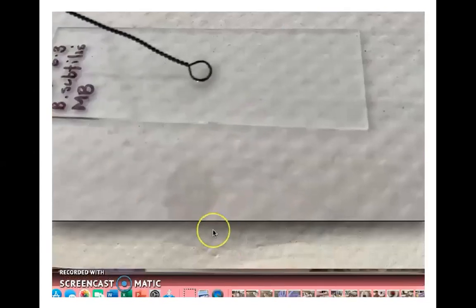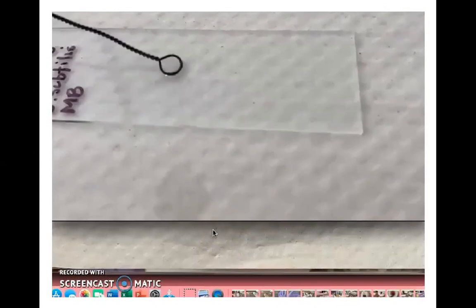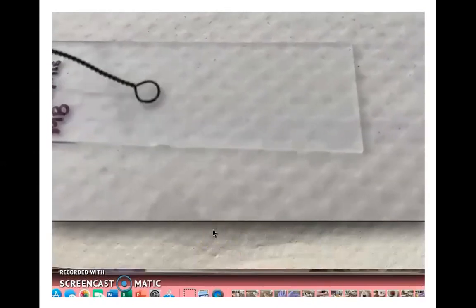Once you have culture on your inoculating loop, you can place that culture onto your glass slide. And you'll see I'm doing circle movements, getting ever wider, and basically spreading that liquid out across the center third of the microscope slide. Of course, we have to let the culture material dry. And all I've done here is I've set the slide down on a piece of paper towel.